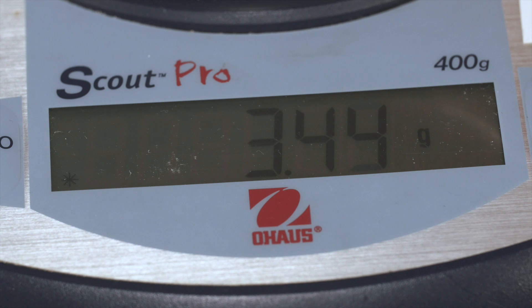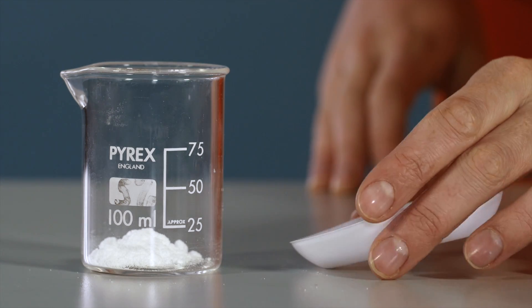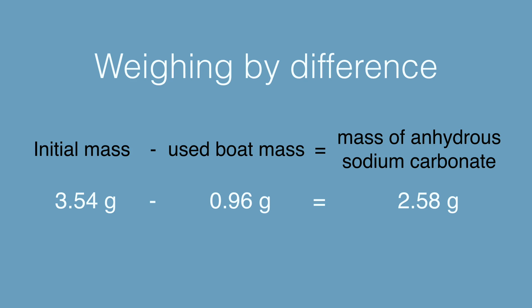Record the mass of the sodium carbonate with the weighing boat. Transfer this solid to a 100 centimetre cubed beaker. Re-weigh and record the mass of the used boat. Using these measurements, you can calculate the exact mass of anhydrous sodium carbonate.